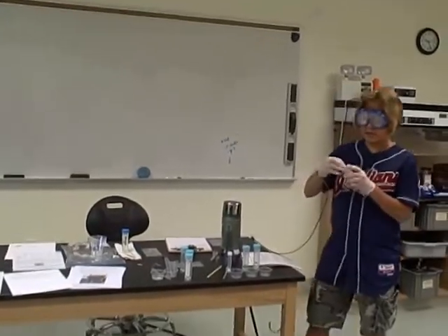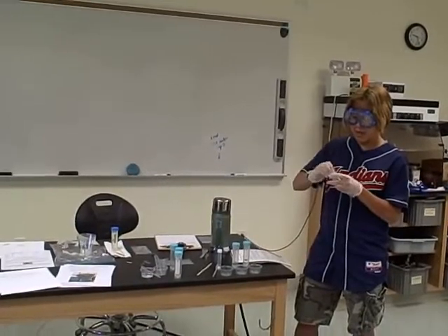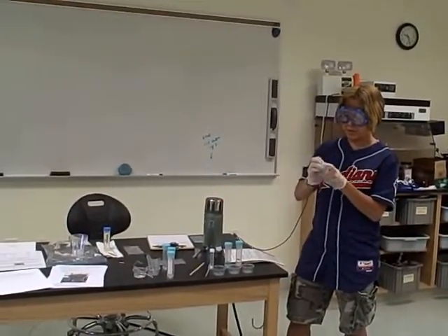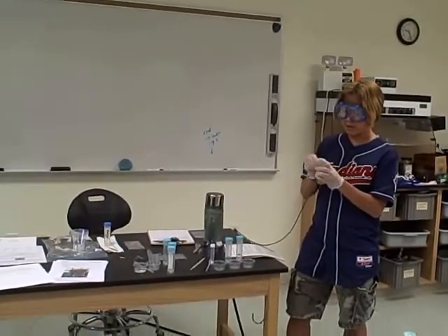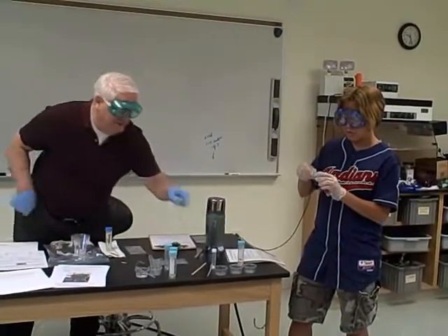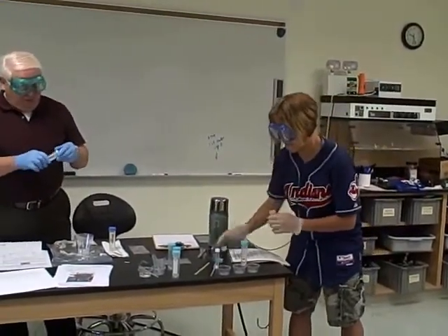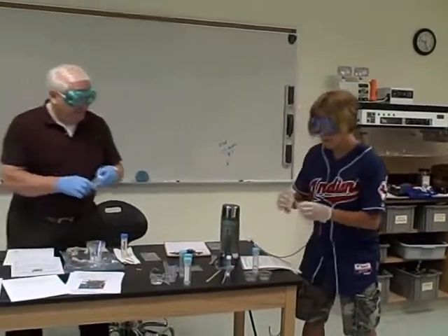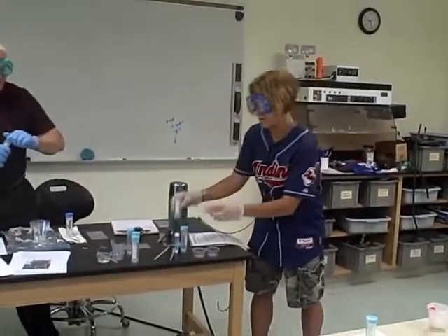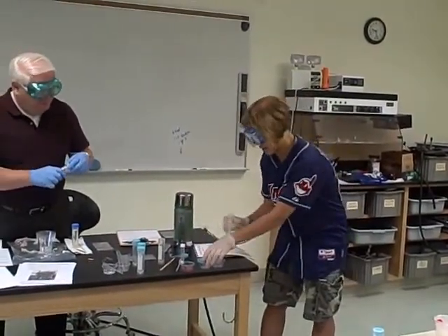So what you're going to do is go ahead and open these containers that are paraffin shut to avoid drippage. And of course, make sure that you have goggles on. Let me help you with those, Susan. Sometimes just opening them will do the trick and remove the paraffin. And you're going to transfer solutions 11 into the cup marked 11 and 12 into the cup marked 12.